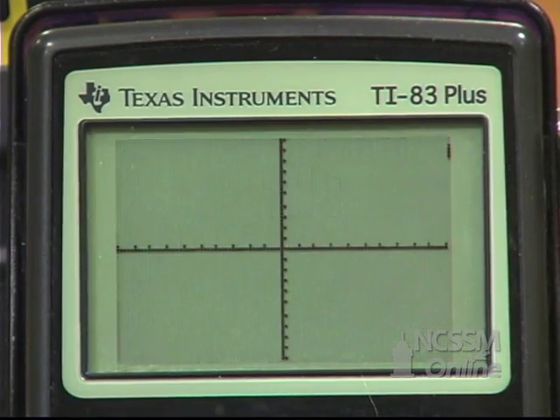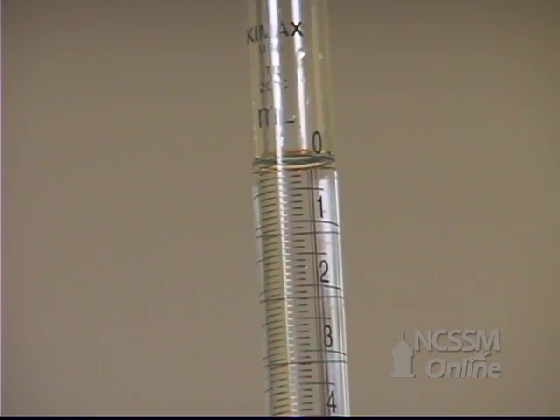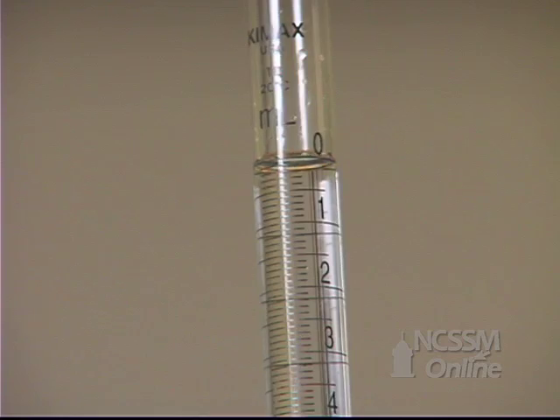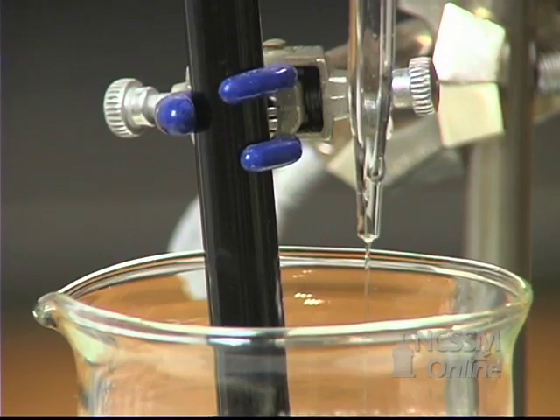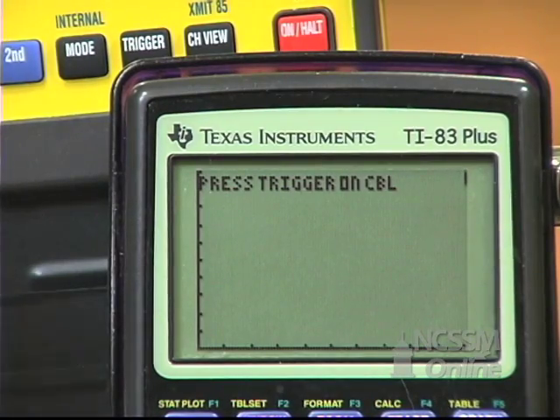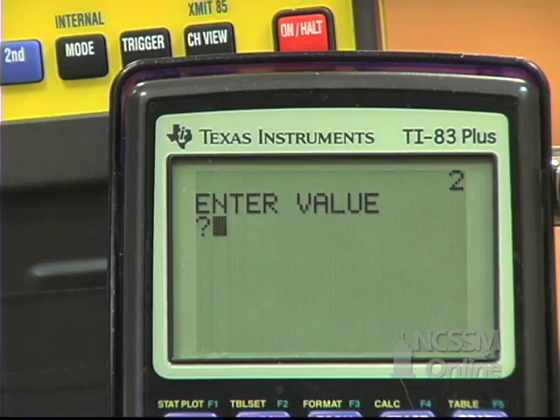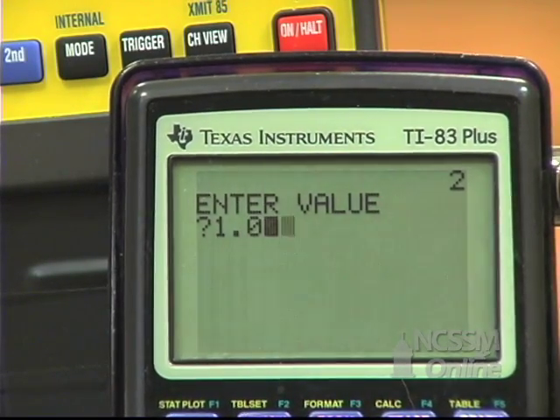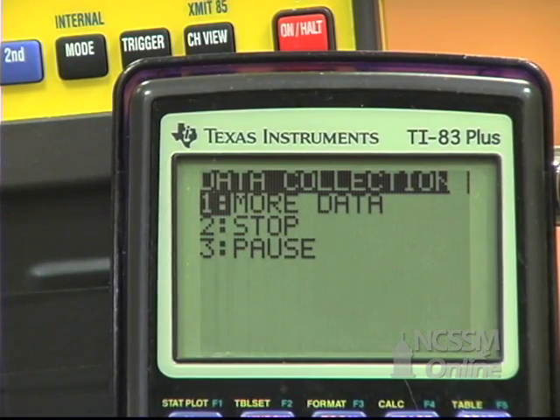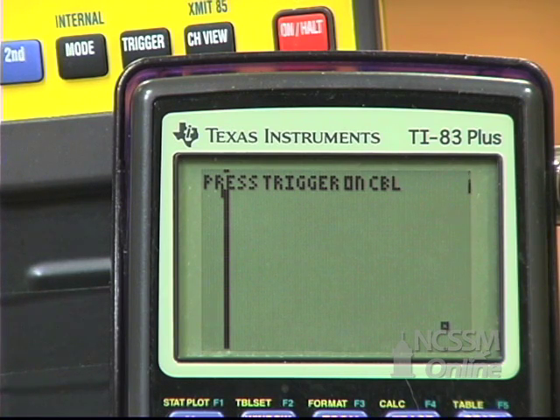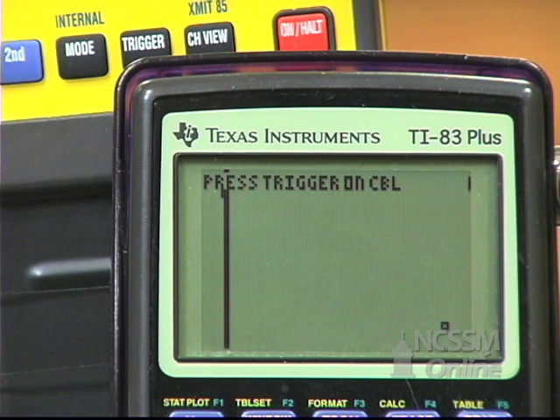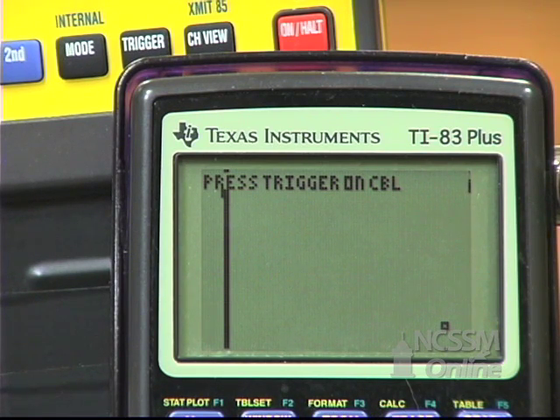Select more data, then add 1 milliliter of the sulfuric acid solution. When the CBL reading is stable, press Trigger and enter the volume of the burette reading — 1.00 milliliters. Continue to add the sulfuric acid in 1 milliliter increments, waiting until the CBL reading is stable each time, pressing Trigger and entering the volume off the burette. Continue until you've added about 30 milliliters of the sulfuric acid solution.